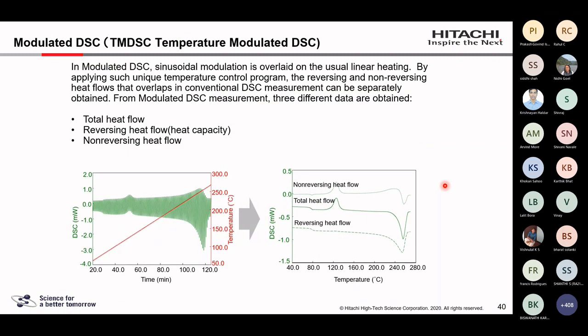Another software which is coming along with the DSC is called temperature modulated DSC.